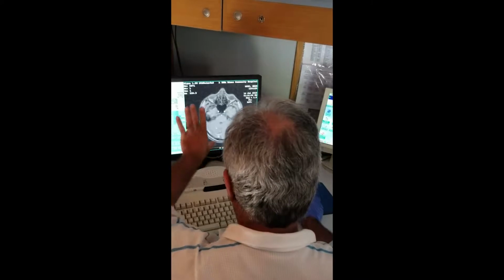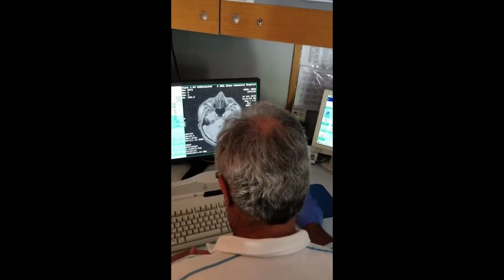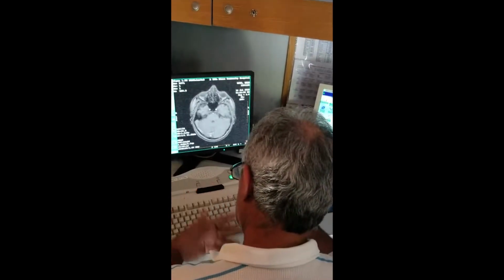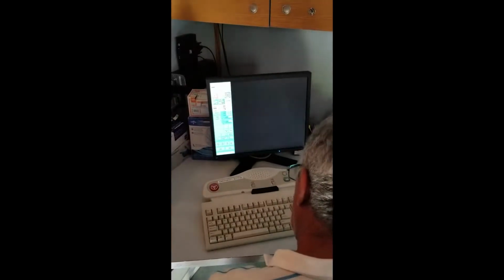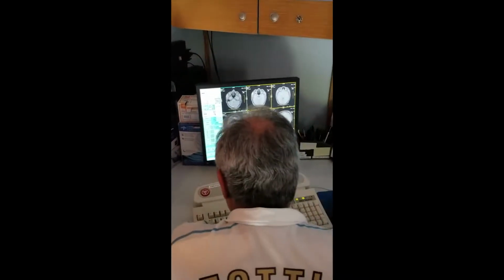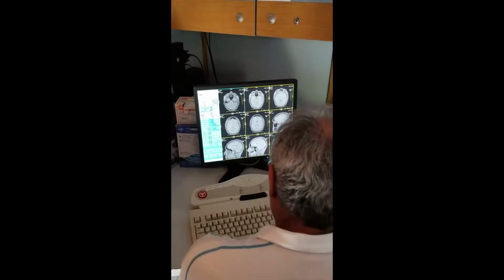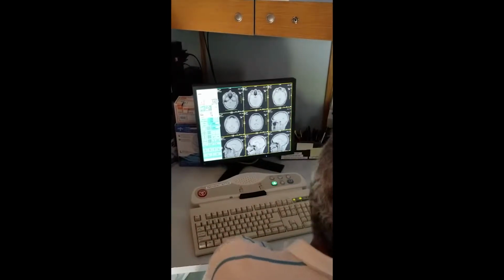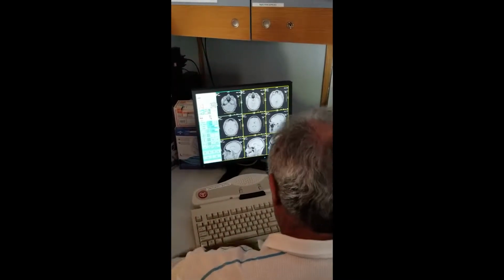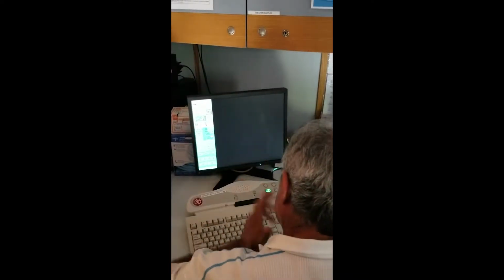So if I want to see 1-on-1, it's like that. But I'm going to say, show me these 9-on-1. So you come to format, not this. Everybody does this. You come to format, 9-on-1. If you're not familiar with it, count. 3 times 3, 9. Wow, so this is the 9. 9 photos on 1. Okay, now, all right, so I saw this, but how about if I want to see 20-on-1?